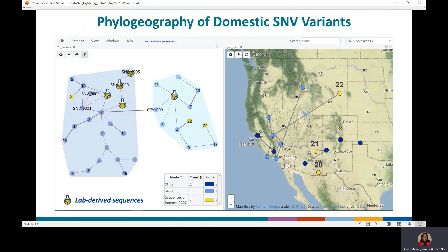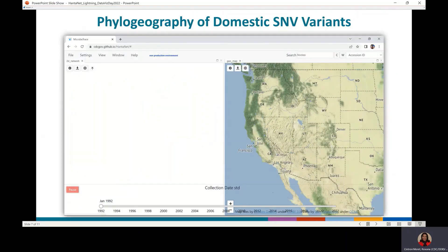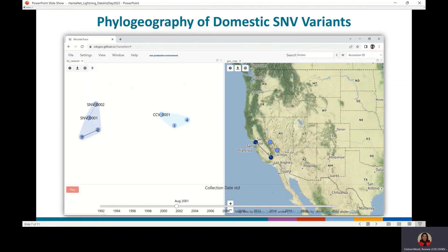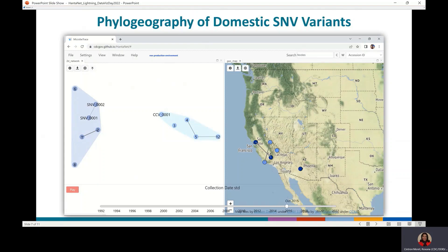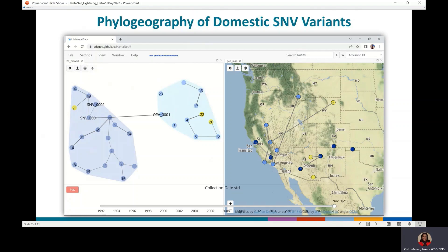The network was overlaid on the map to perform a spatiotemporal analysis of domestic Sin Nombre virus variants. We observed the geographic location and spread of Sin Nombre virus variants in the United States and potential human exposure locations based on sequence similarity of the viral large gene. Nodes with a number label and available state and county level data would appear in the map.